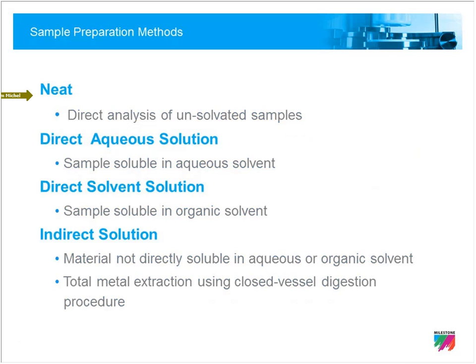You also, if your samples are suitable for this, if they can be directly dissolved in either an aqueous or an organic solvent, that is also applicable and open to be used. And then you also have the indirect solution technique for sample prep. And that is required when your material or your sample types are not directly soluble in a solvent system of some kind. And here we would be doing total metal extraction using a closed vessel digestion procedure.